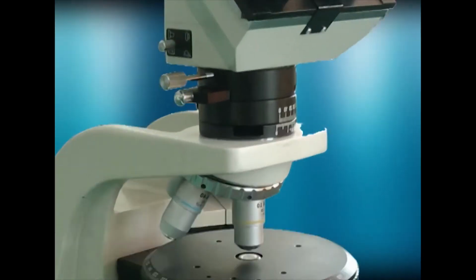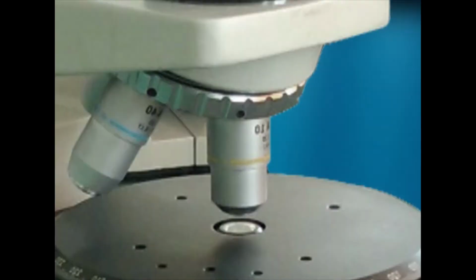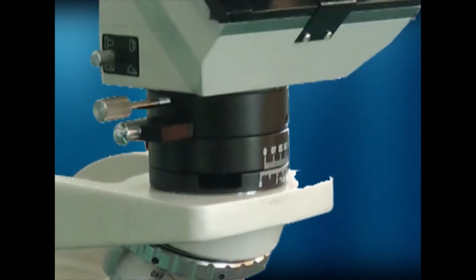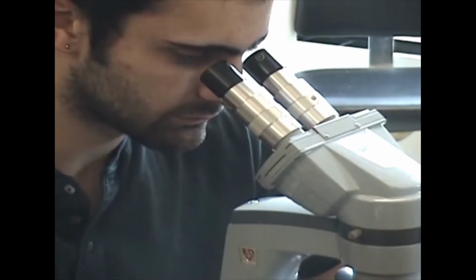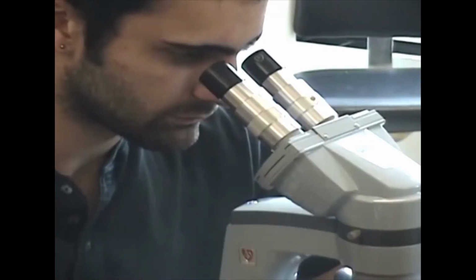The microscope tube. In its simplest form, the microscope tube is a straight metal tube that separates the objective and the ocular. In most microscopes it is straight, but in some microscopes it is inclined at an angle to enable the observer to sit comfortably and work.